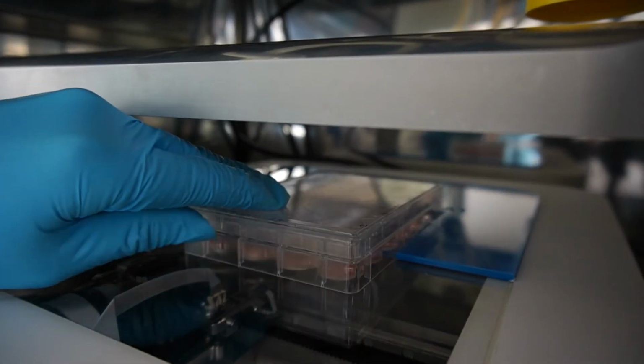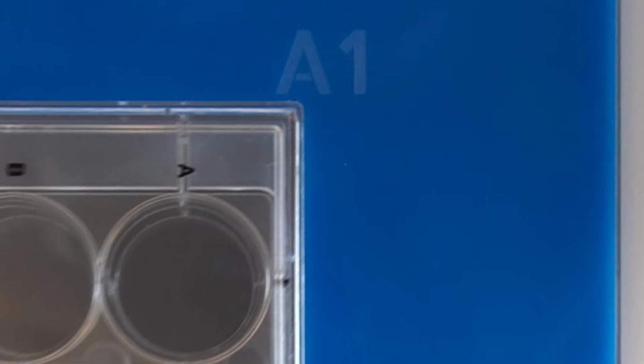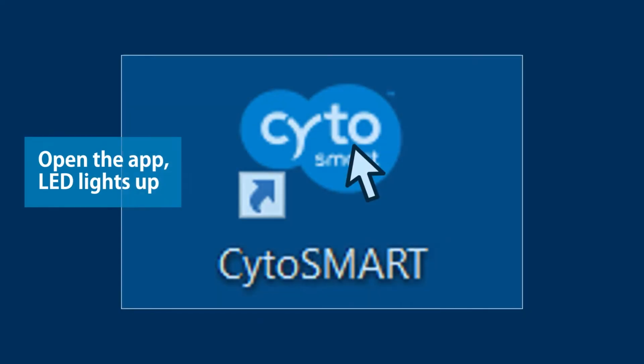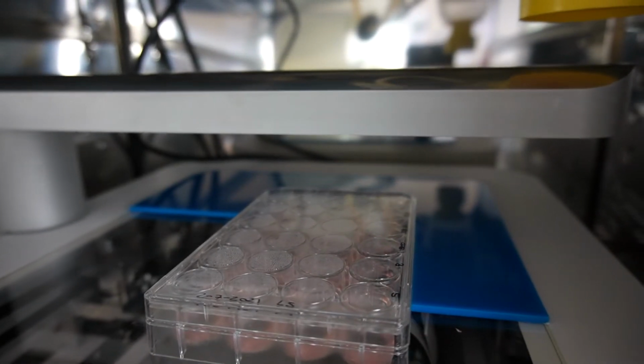Position the A1 well of your well plate in the A1 labeled corner of the adapter plate, keeping the long edges of your plate parallel to the long sides of the Omni. Open the CytoSMART app and log into your account. The green LED of the device will light up, and the camera will move to its ready position.